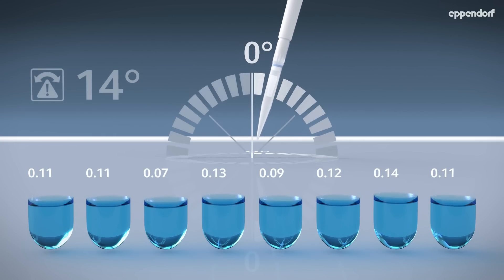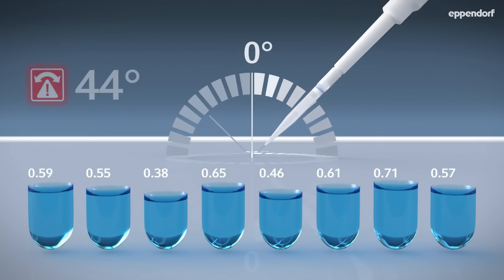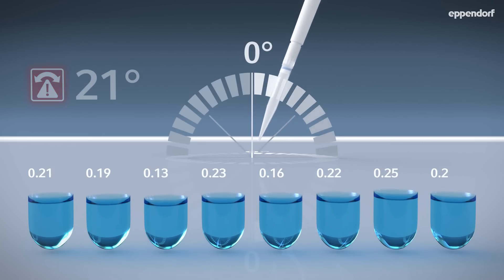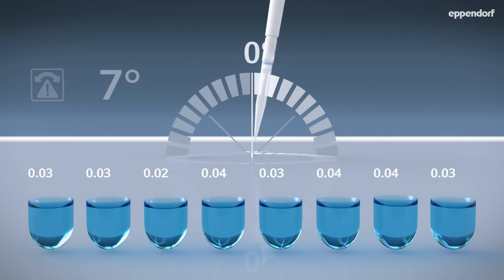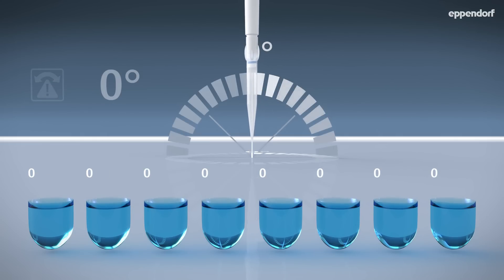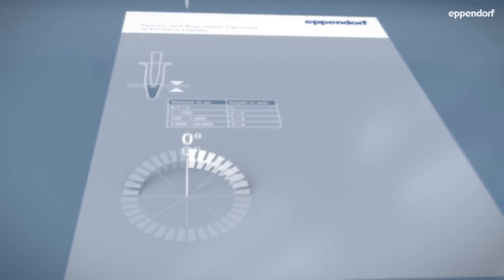The more you tilt the pipette, the more liquid you'll dispense. It's difficult to control this effect, since the variations are too small to see with the naked eye. For best results, just keep the pipette as vertically as possible.